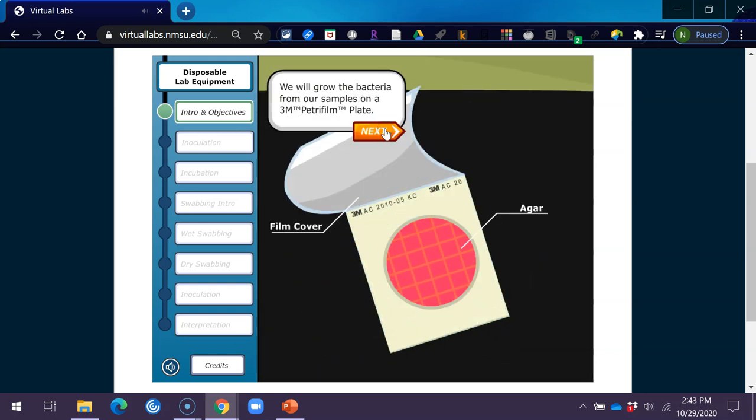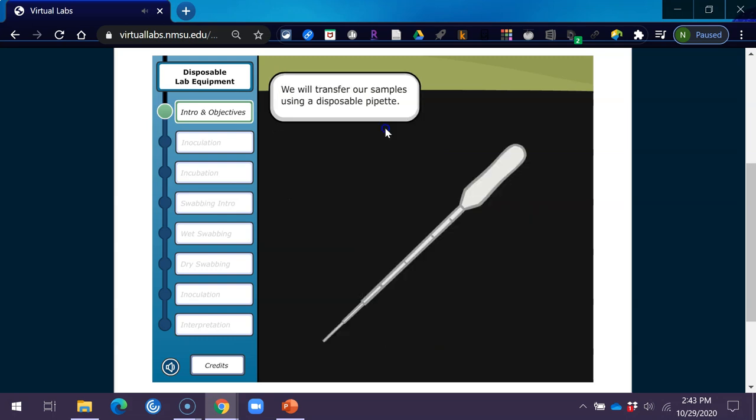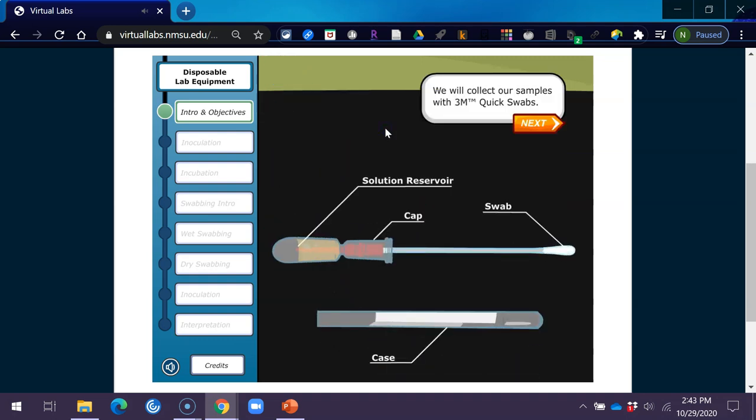We'll grow the bacteria from our samples on a 3M Petri film plate. We'll transfer our samples using a disposable pipette. We'll collect our samples with 3M quick swabs.